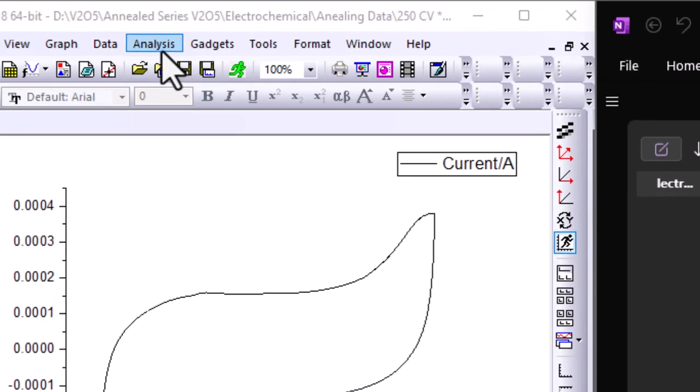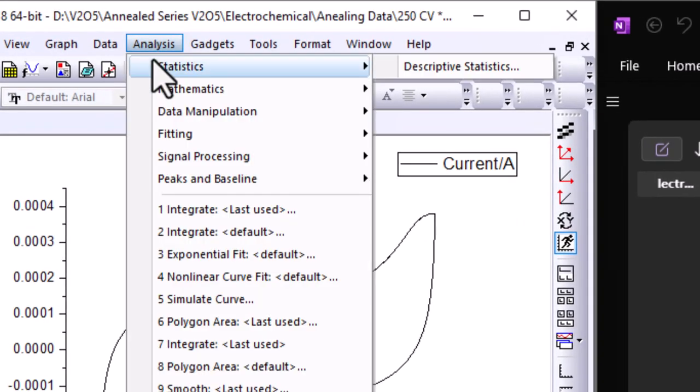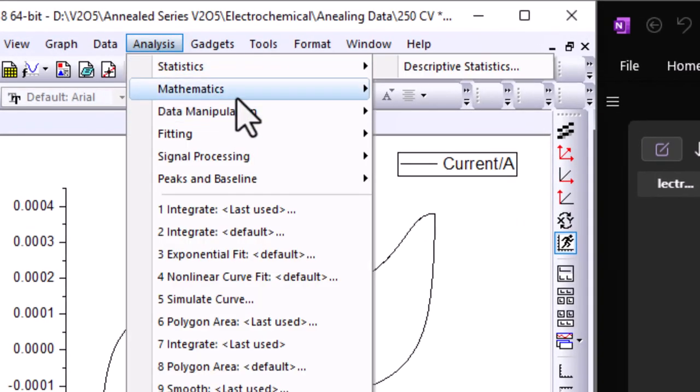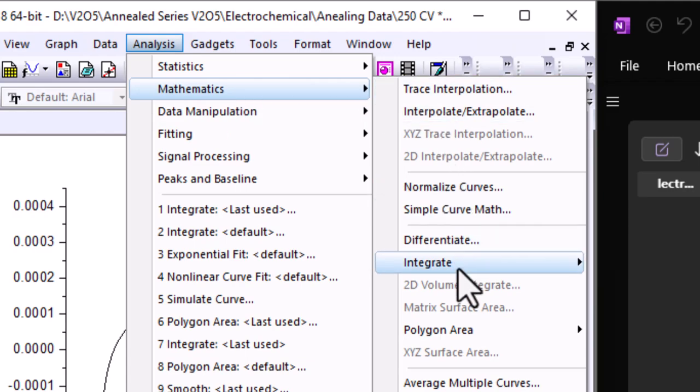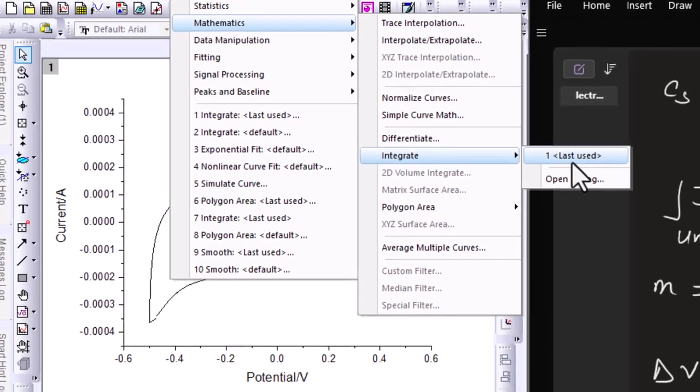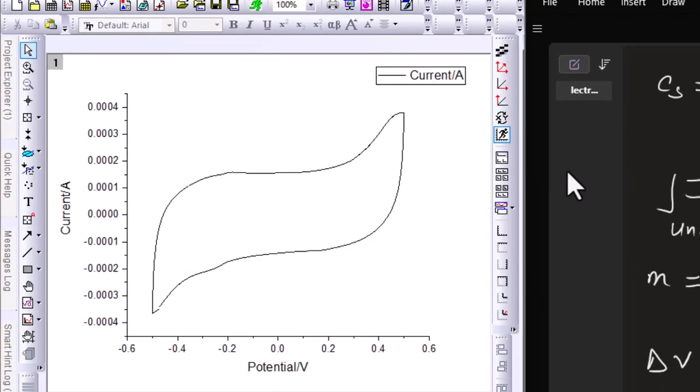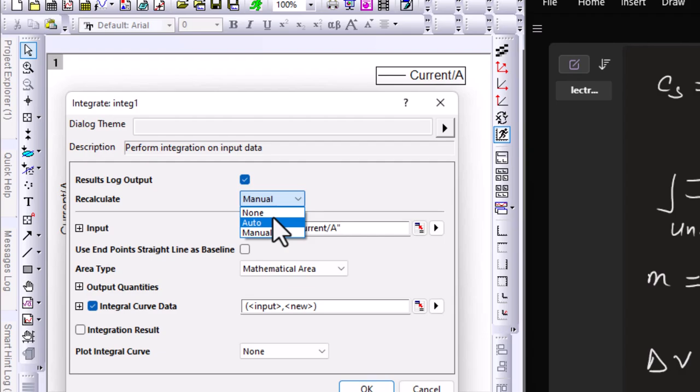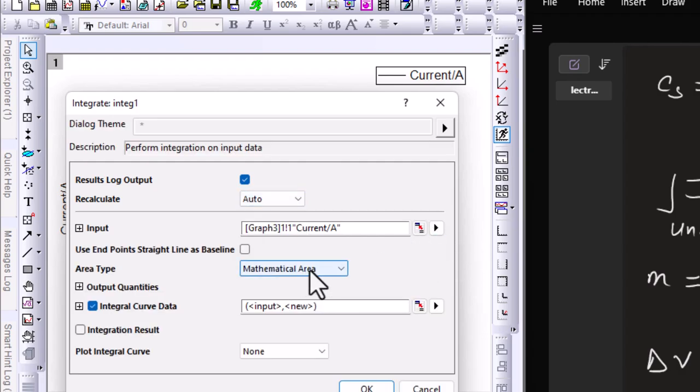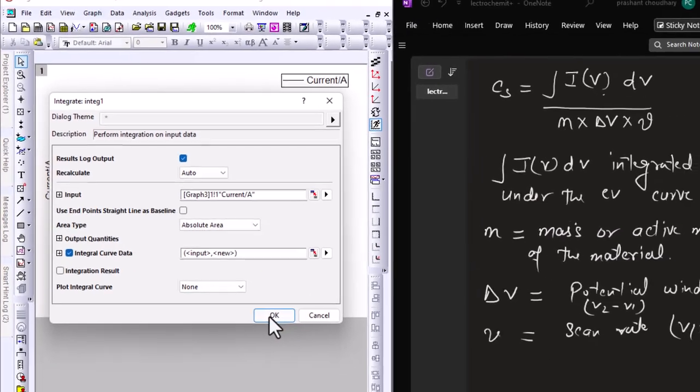To find the integrated area of this curve, you need to click on Analysis, then go to Mathematics, then go to Integrate and open the dialog.